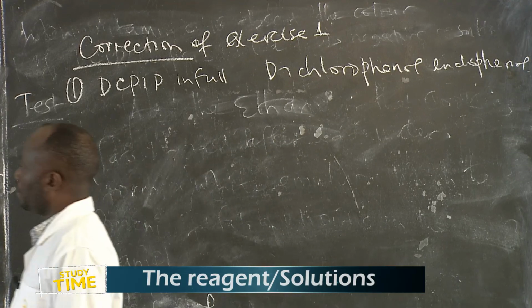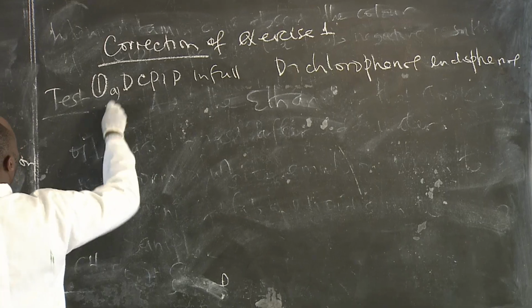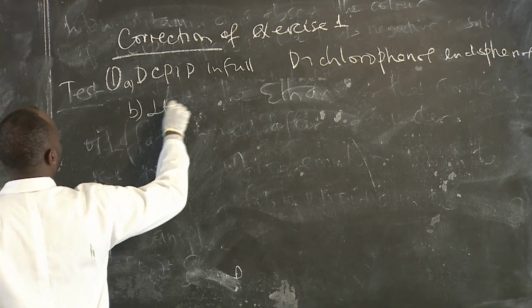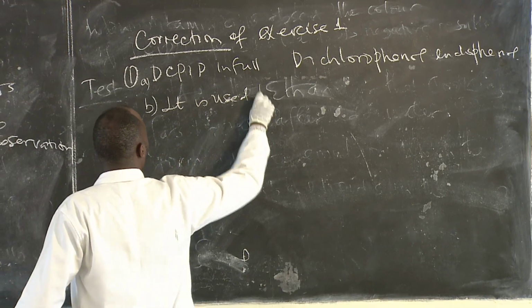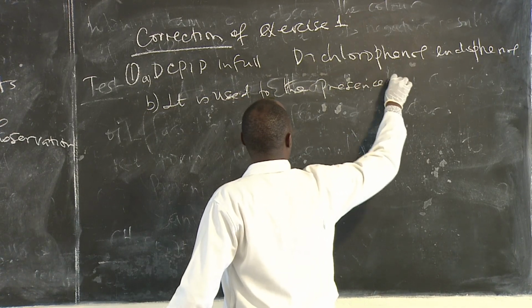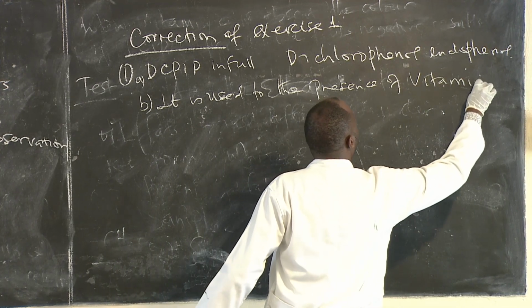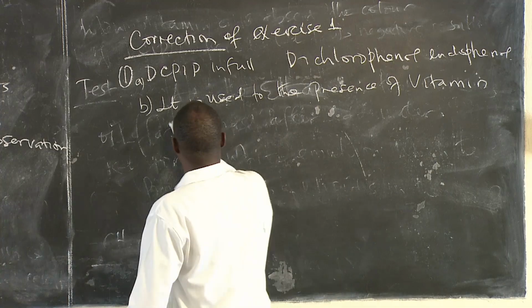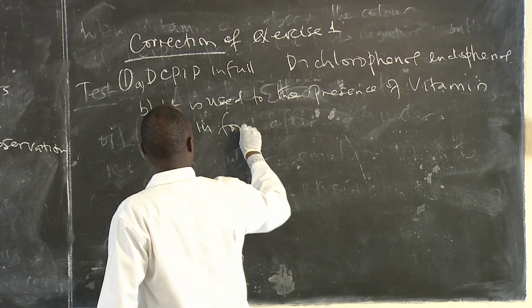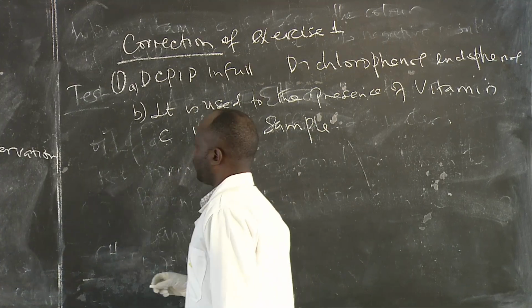What is it used for? It is used to test the presence of vitamin C in the food sample. Good, excellent.